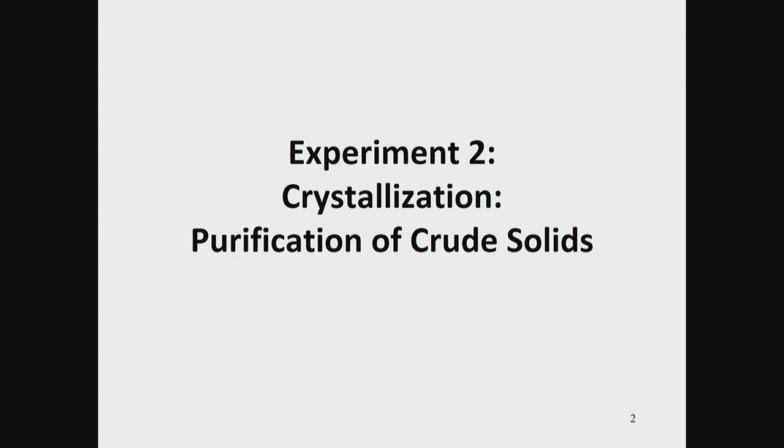So crystallization is a purification technique. You'll remember melting point was used to establish purity, but crystallization is actually used to purify. So we're looking to try to make crude solids pure with this technique.